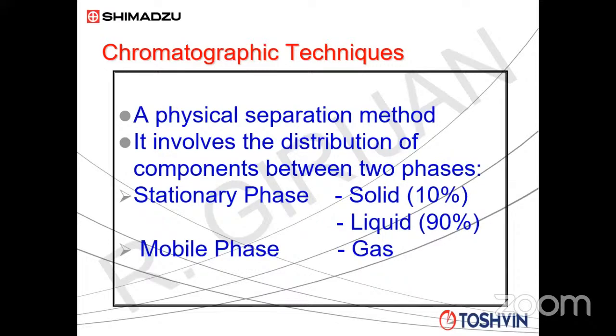For example, you talk about pharmaceutical analysis, food chemistry analysis, perfumery analysis, or environmental analysis. Normally, we try to use a liquid stationary phase. So it has got wide applications, very widely used by different customers, different segments. That's the reason why I'm approximately giving a 90% weightage to liquid stationary phase.